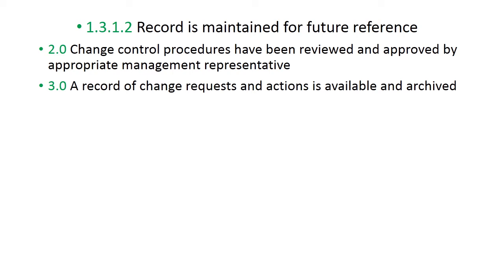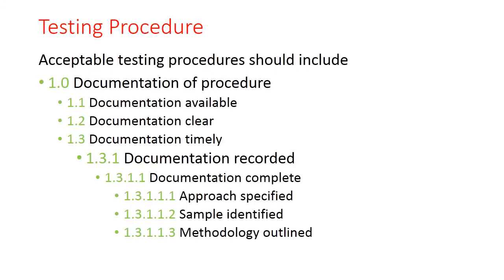So first we have to place a request that there is a need to make a certain change in the standard operating procedure. We have to justify our request, and after getting proper permission from laboratory management, we can take certain action. But all these things we have to document properly, and this document should be archived so that in future during the audit process we can reproduce them.